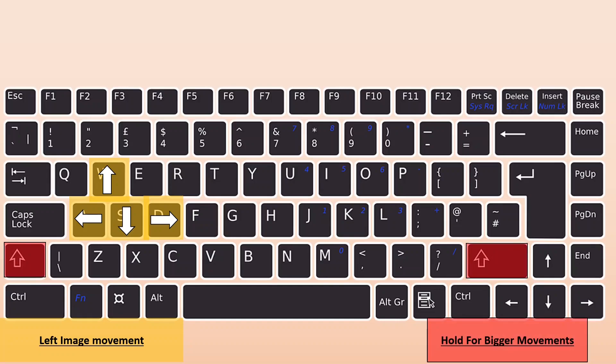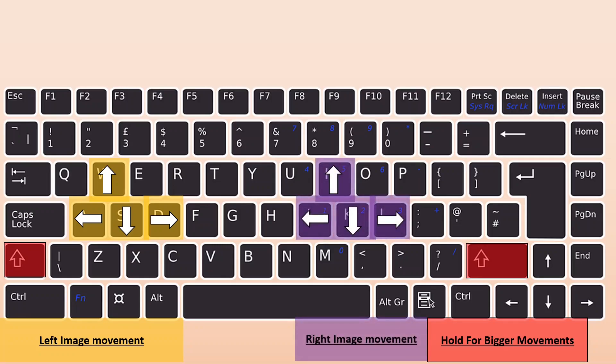I think it's programmed right now so if you press just the keystroke once, it moves it one pixel. But if you hold down shift, it's either five or ten pixels. So you get much bigger move increments if you hold down shift. For the right image, you're going to use the IJKL keys in the same fashion, and holding shift does the same thing for that.